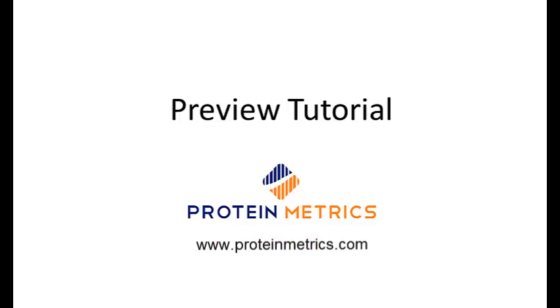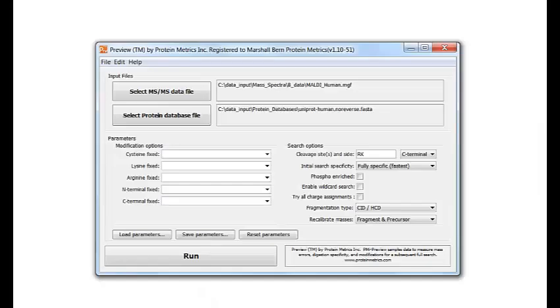Hello, I'm Marshall Byrne from Protein Metrics. This tutorial explains how to use our Preview software to improve proteomics data analysis. Preview is a program that performs a fast initial search of a shotgun proteomics dataset to help you decide how to set parameters for a subsequent full search.